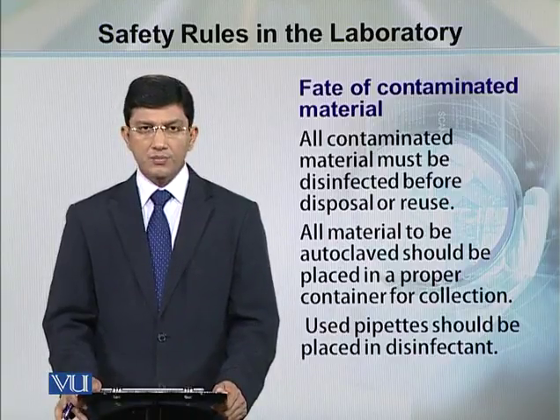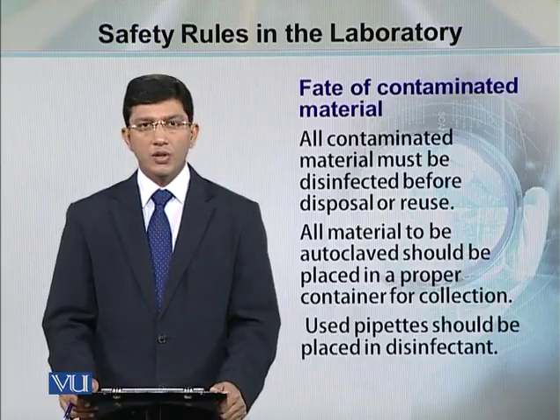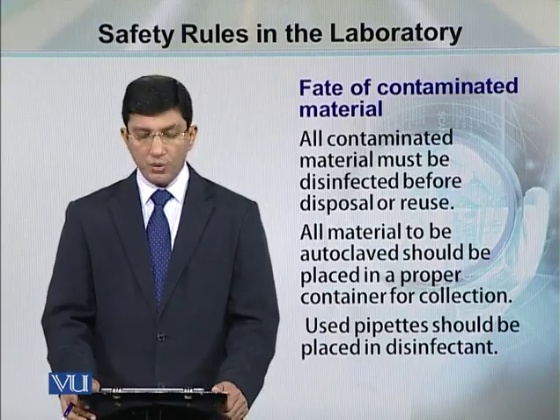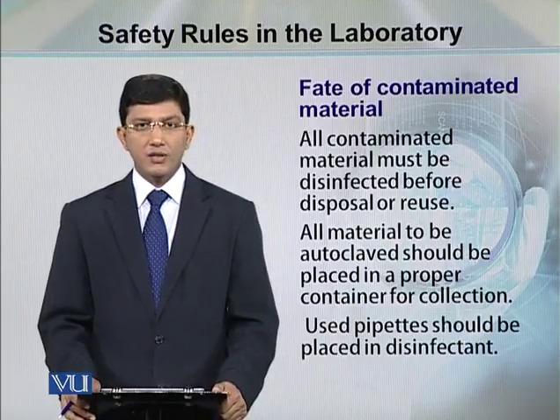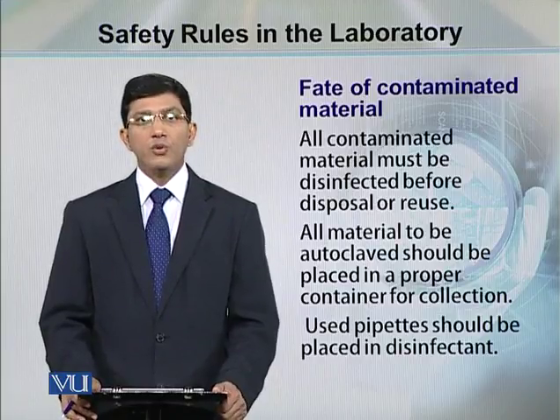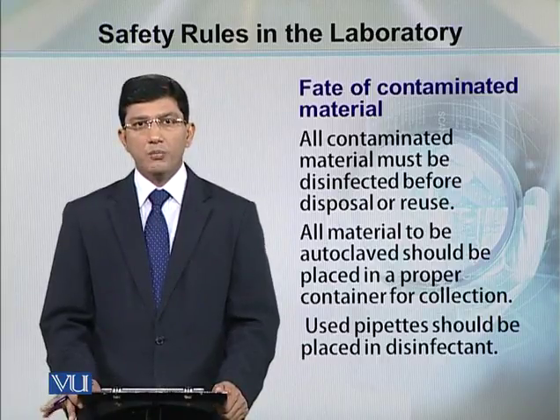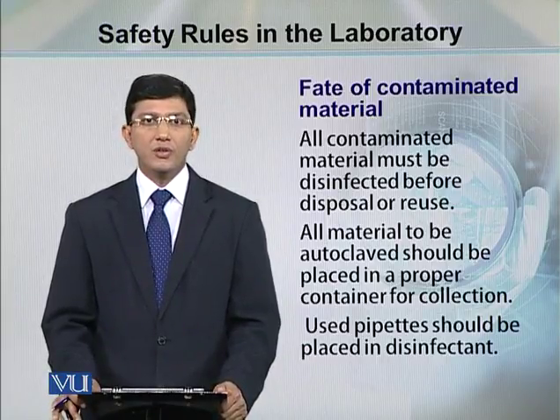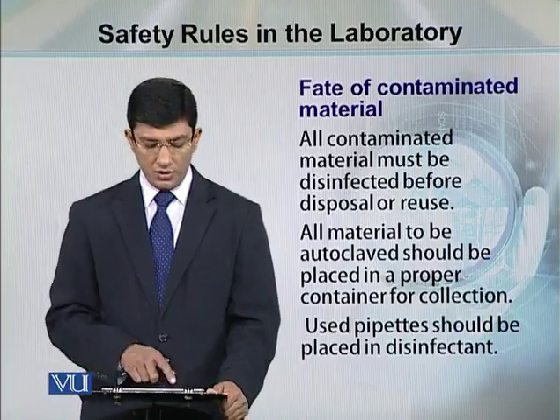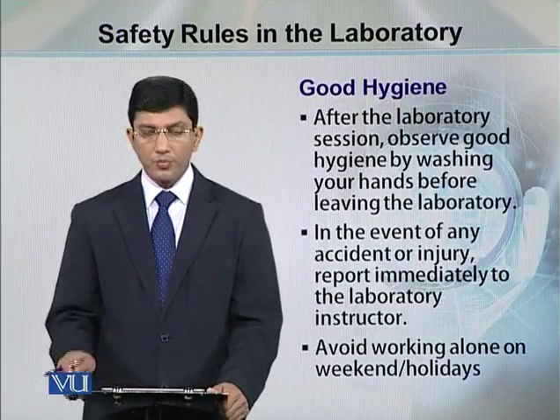All materials should be autoclaved if they are autoclavable, and pipettes should be placed in disinfectant solutions so as to disinfect them. Don't use any infected material, infected liquid, infected pipette or glassware for your new experiments, because it will ruin your experiments and the actual results will not be available.